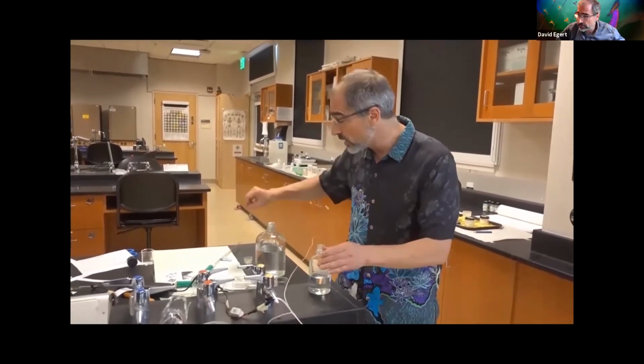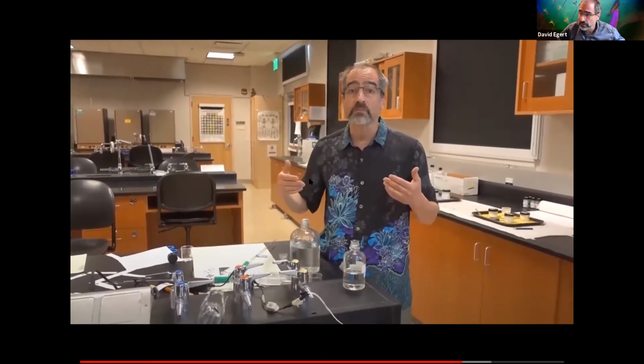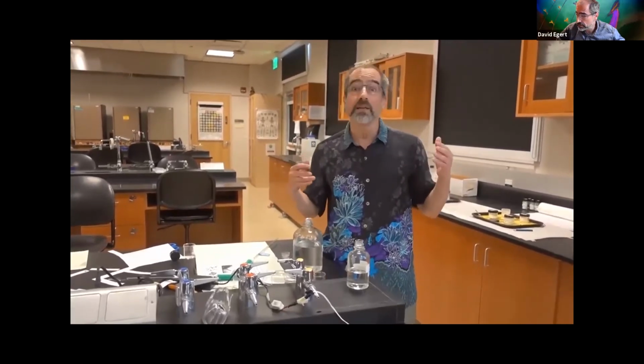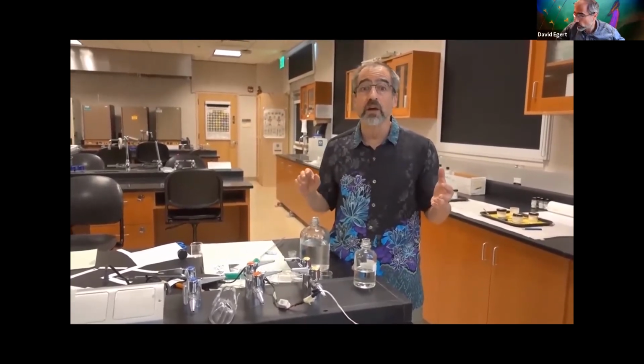And that's more data I'd be recording in my lab notebook. And a little later on, I'll be spending more time interpreting what it all means. But the first step, while you're actually getting the data, is just to keep an accurate record of your observations.